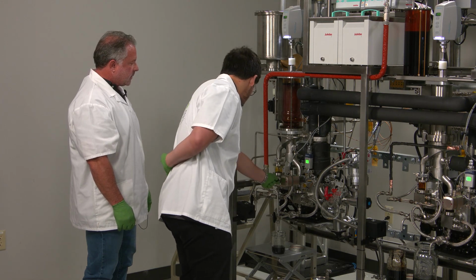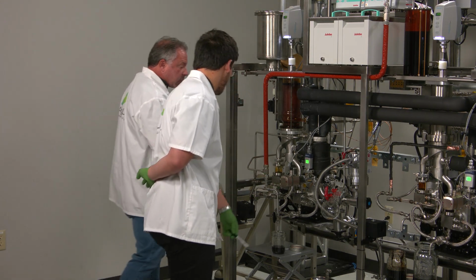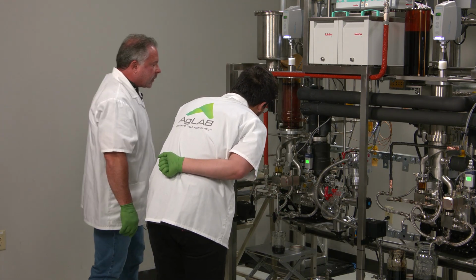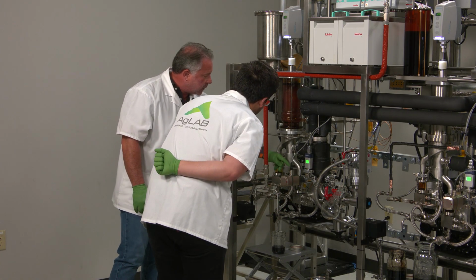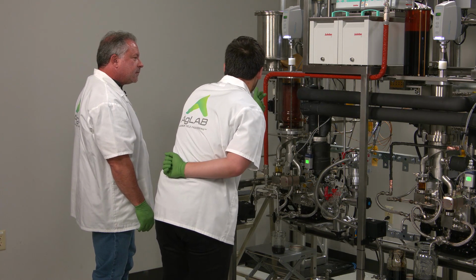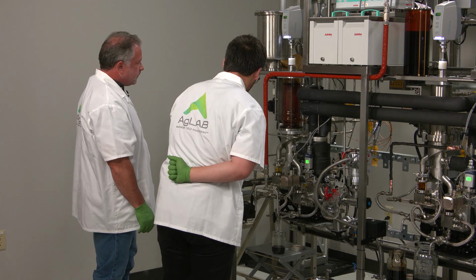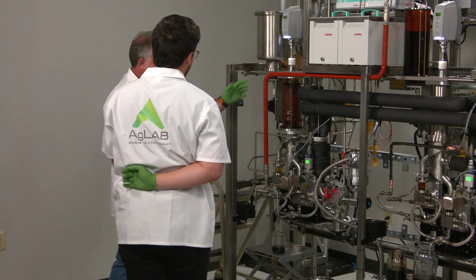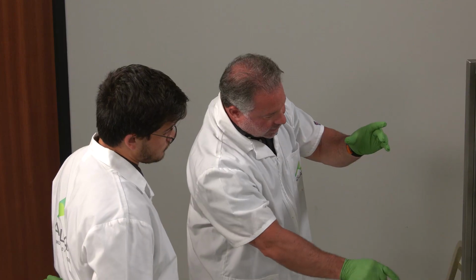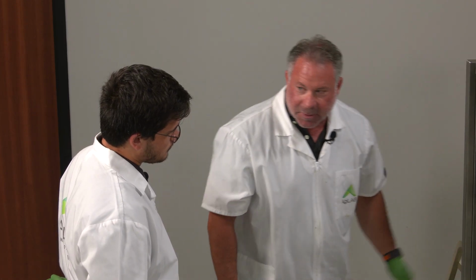Correct. So then what's the temperature inside of here, through this whole section, all the way through this whole section? Okay. Everything's at 30 degrees. So there's no change all the way down through there. Okay, so then it just builds up and that creates a flow down all the way to the line. Okay. Everything condenses onto that centerpiece condenser and runs down into what you see dripping right there.